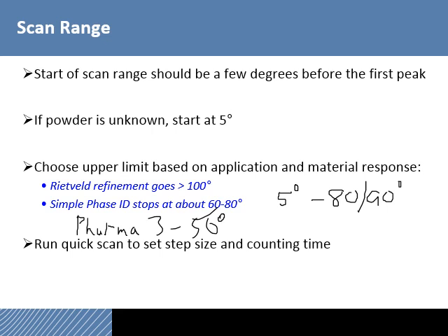If you're working with metals, the d-spacing in a metal is actually quite small, all right? So the majority of the peaks are pushed out farther to the right, to higher 2 theta values. So you may not need to start low. With some metals you could start at 20 degrees because there'll be no peaks below that. I think I mentioned earlier the stainless steel sample holders at the low angles result in a high background, but they don't result in any diffraction peaks because there are no peaks at those locations where the beam is spilling off the sample and onto the sample holder.